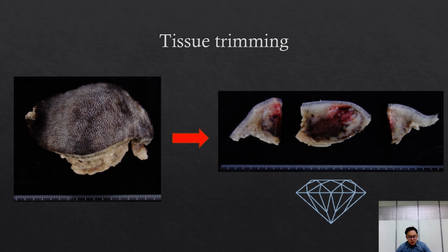So this is an example of how we would go through sampling tissue from a skin mass. There's no hair on the surface because it would have been shaved for surgery. And you can see that this is a bit of diamond shape. Usually when they take samples out of the skin, we get a diamond-shaped piece, ideally with a mass in the middle, and with some tumor-free clean skin margins around the outside, as well as usually a layer of tissue deep to the mass, like a muscle layer, to try to avoid taking the tumor out incompletely, with some tumor left deep in the tissue.